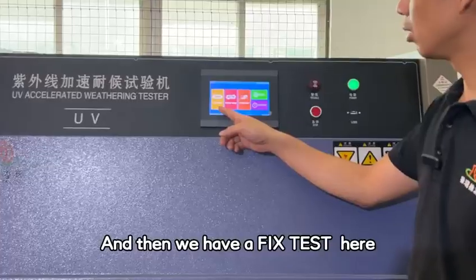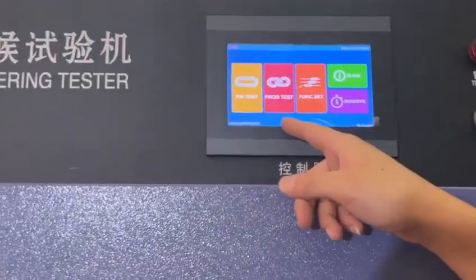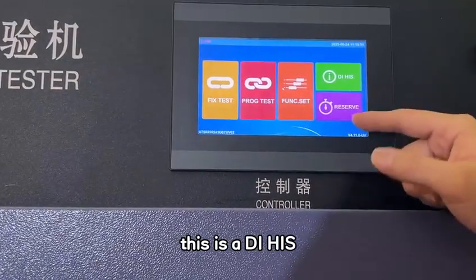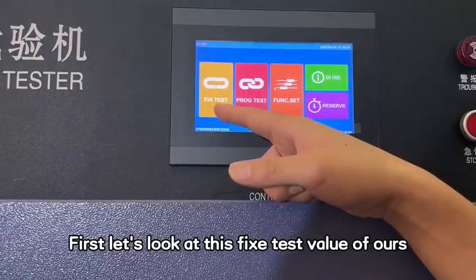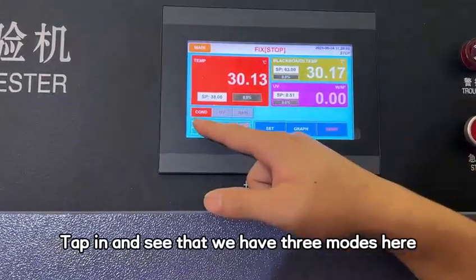And then we have a fix test here. And then we have a prog test here. And then this is a func set. This is a display and a reserve. First let's look at this fixed test of ours. Tap in and see that we have 3 modes here.